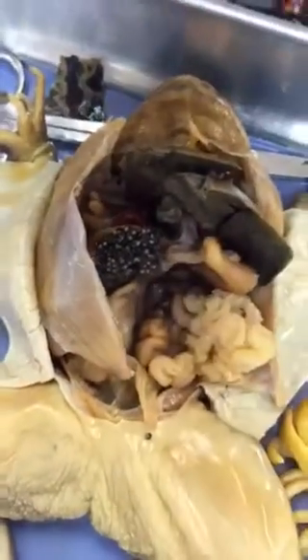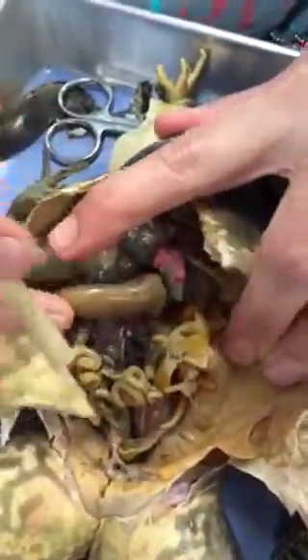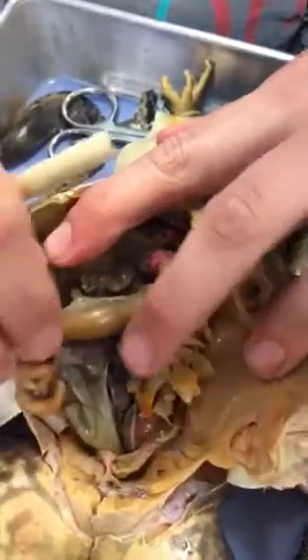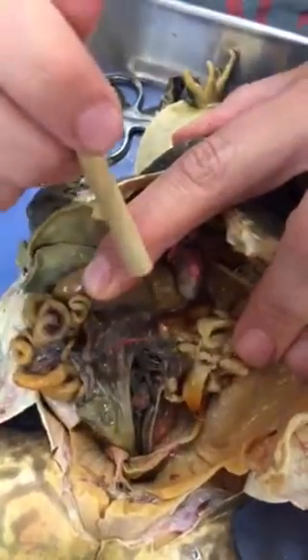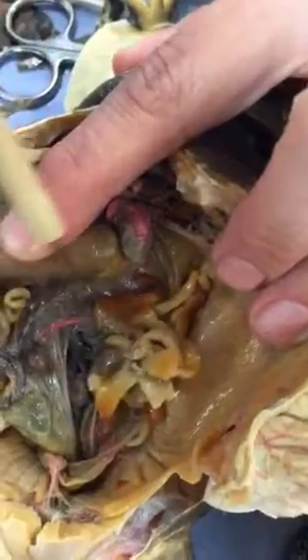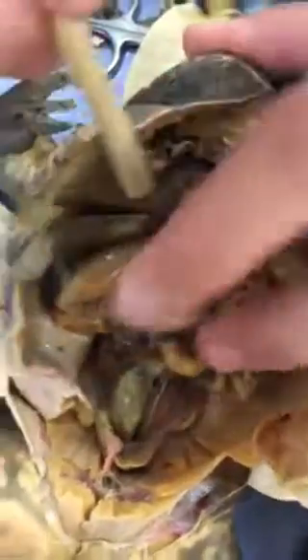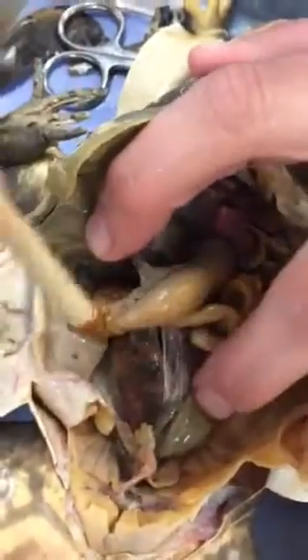We have a male. Okay, so on this one, there's no obvious ovaries or eggs, and so we can separate and find the spleen because it's in the mesentery of the small intestines, and then over here is the testes. On this particular one, it's kind of at the base of all these fat bodies, so there's a testes there, and then there should be one on the other side, and there's the other testes. And then here's the kidney on this one.